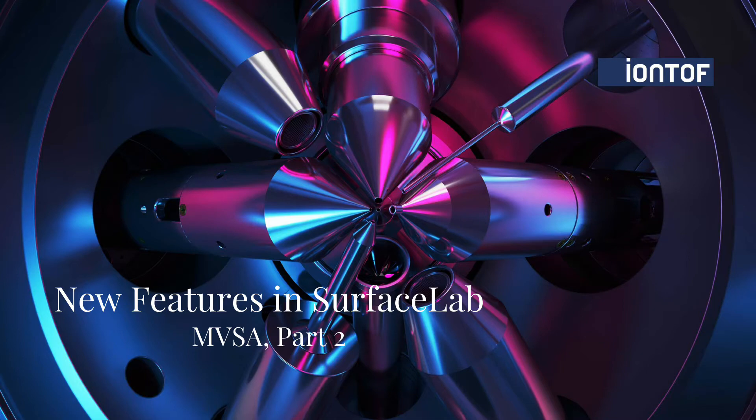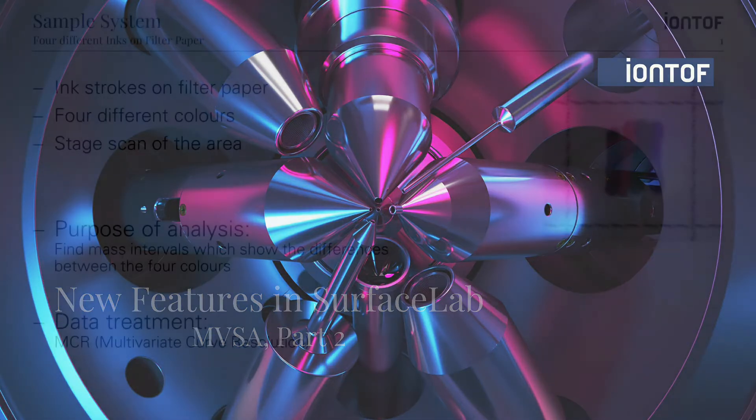In the last video we learned how to perform MVSA calculations on images in Surface Lab, and today I would like to show you the results.